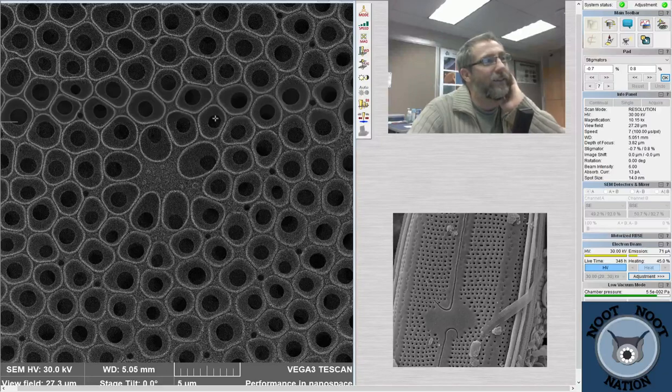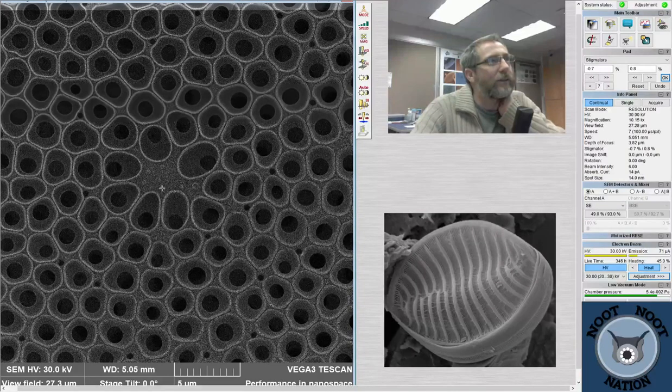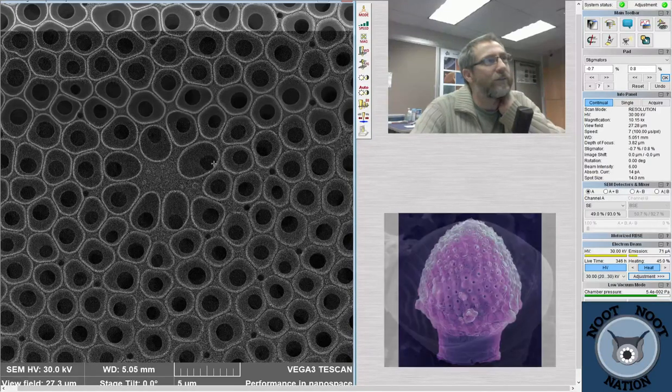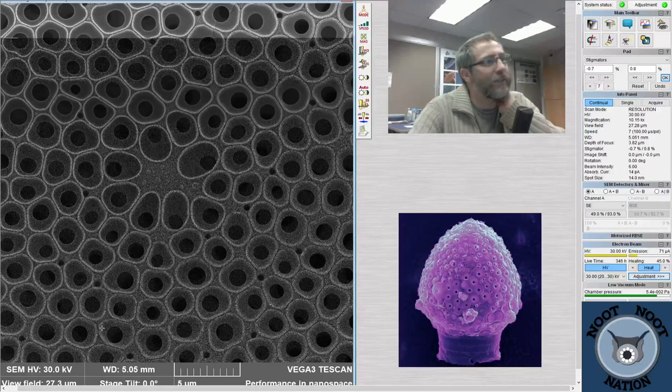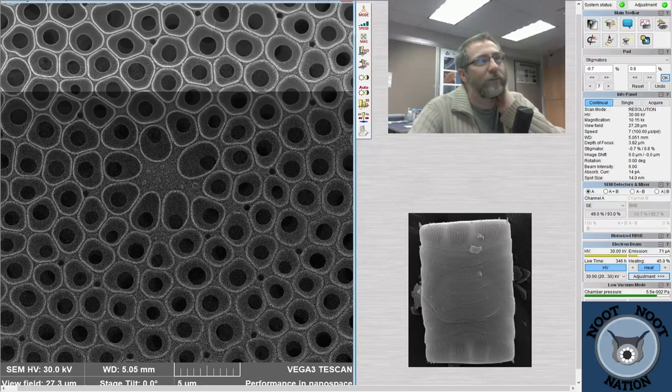It's like a turtle shell or something, right? With this really cool pattern on it, it's just like there. Sometimes it's the kind of nature itself, you know, that it comes up with these sort of unique shapes. So many things, and it's so intricate. And when we look at the scale bar, that's 5 microns. I mean, think about how intricate that pattern is. And it's 5 microns.